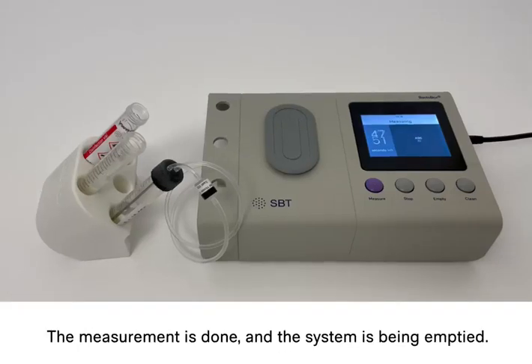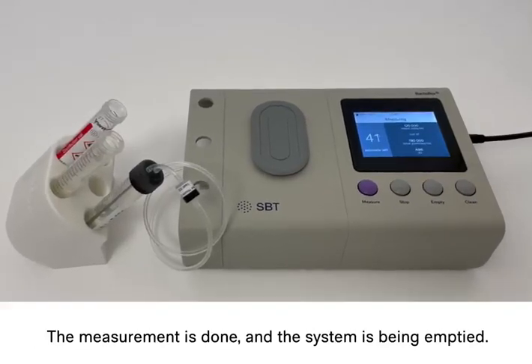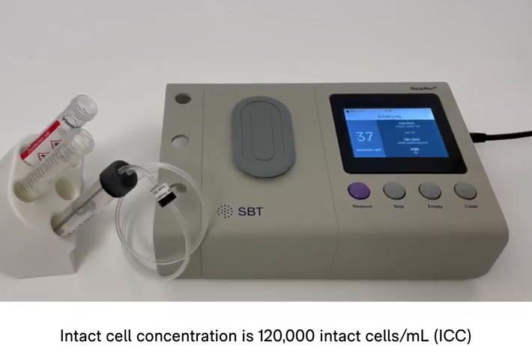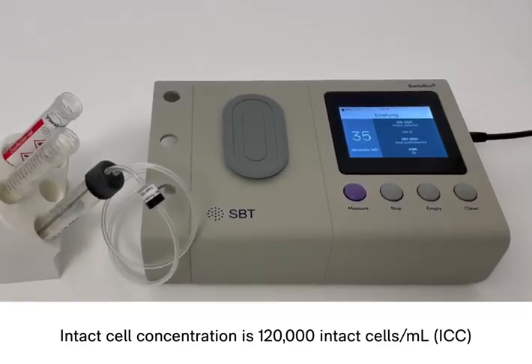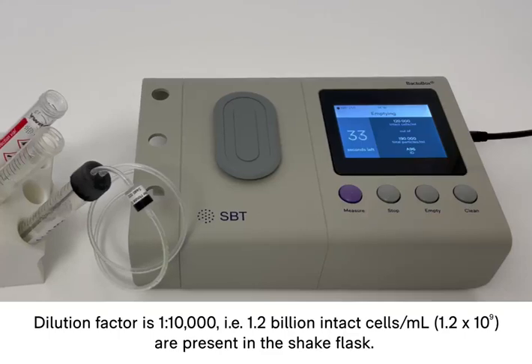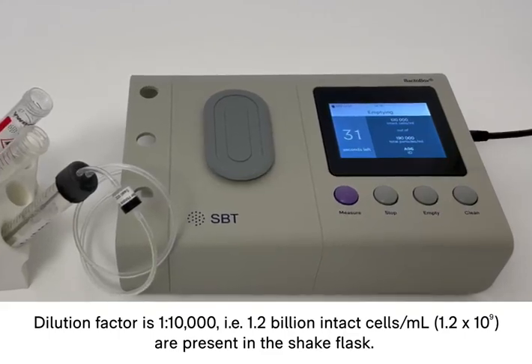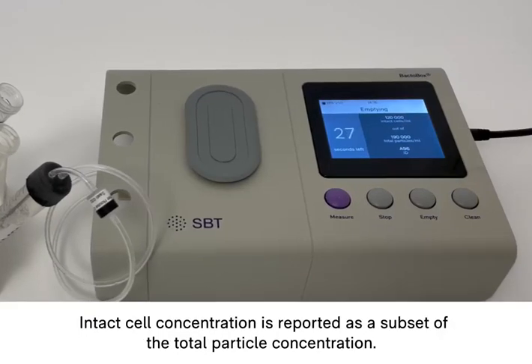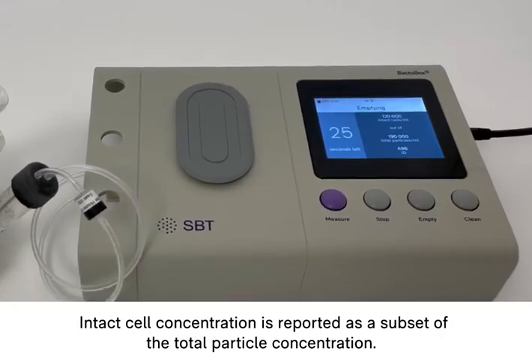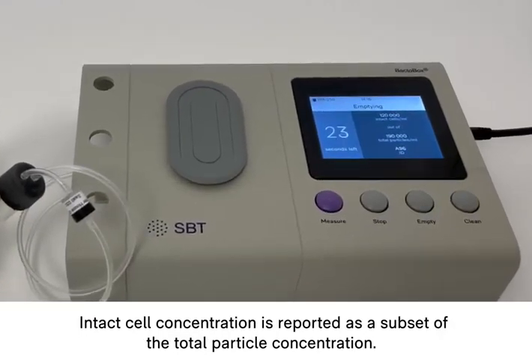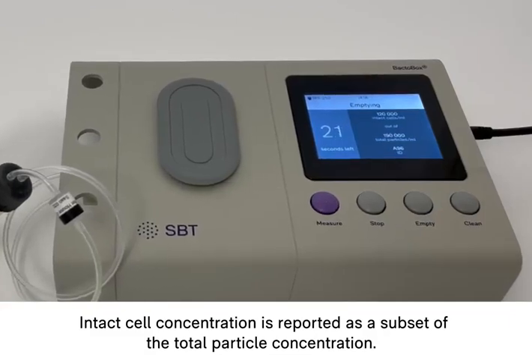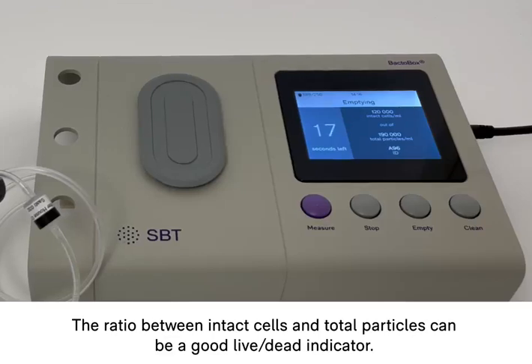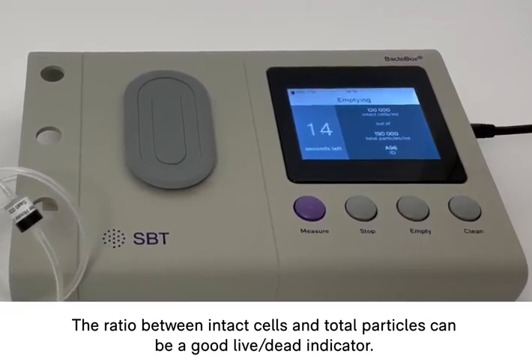Now the measurement is done and the system is being emptied. The display shows that the intact cell concentration is 120,000 intact cells per mL. When multiplied with the dilution factor, this corresponds to 1.2 billion intact cells per mL. Note that the intact cell concentration is reported as a subset of the total particle concentration. If you're following something like a growth curve, the ratio between intact cells and total particles can be a good life/death indicator.